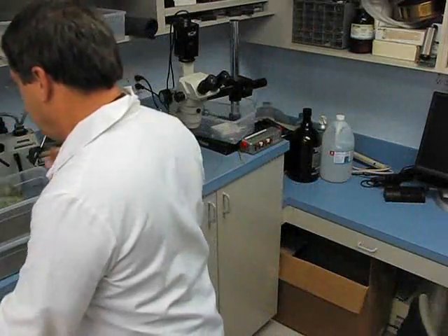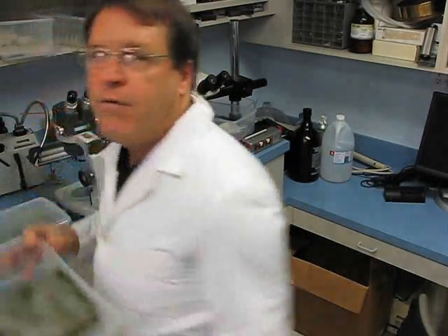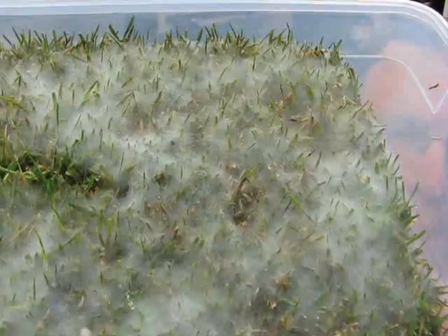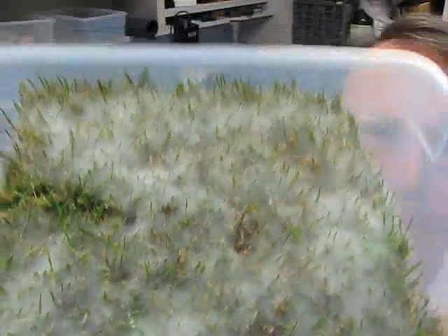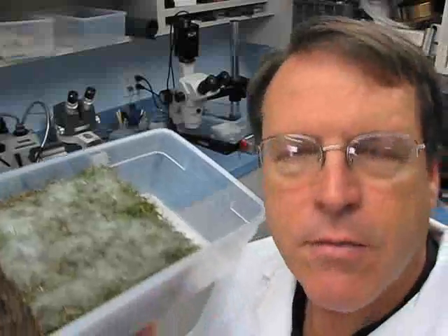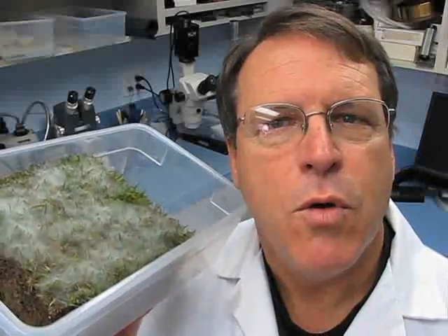Here's what it looks like after we let it incubate a little bit longer. If you had difficulty seeing the mycelium in the previous segment, I don't think you'll have any trouble now — it looks like pretty solid coverage with mycelium. We'll take a look and see if we can pick around in here and find some oospores or chlamydospores, something that would give us an idea of what the species is.